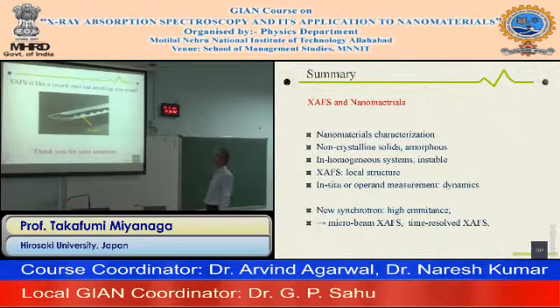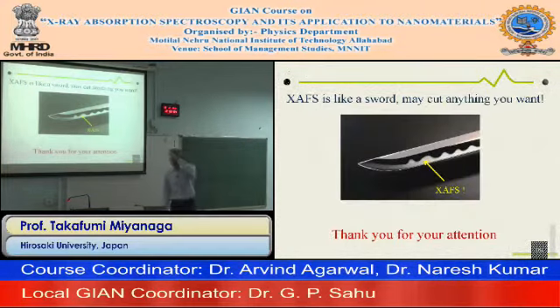So in my image, EXAFS is not a complete technique. XRD, Raman spectrum, IR spectrum, XPS, every measurement facility has its own merit. So the EXAFS merit is that one EXAFS technique is applicable to many systems.